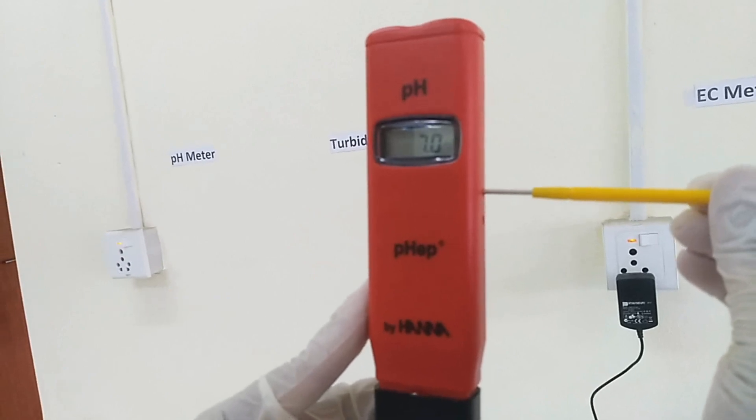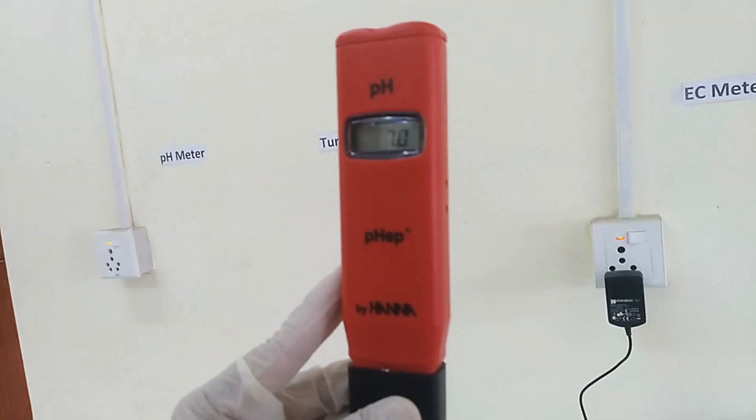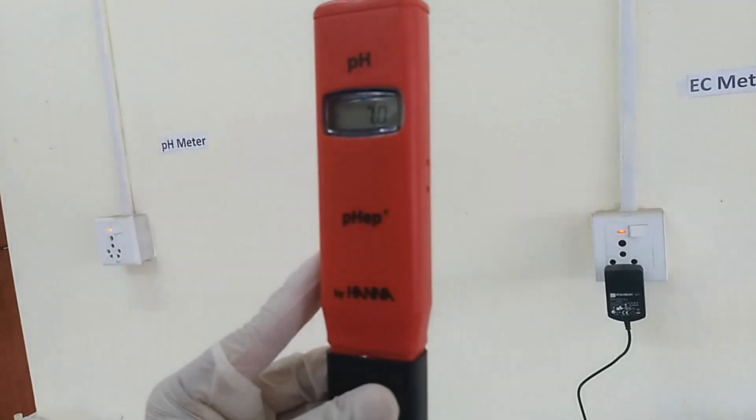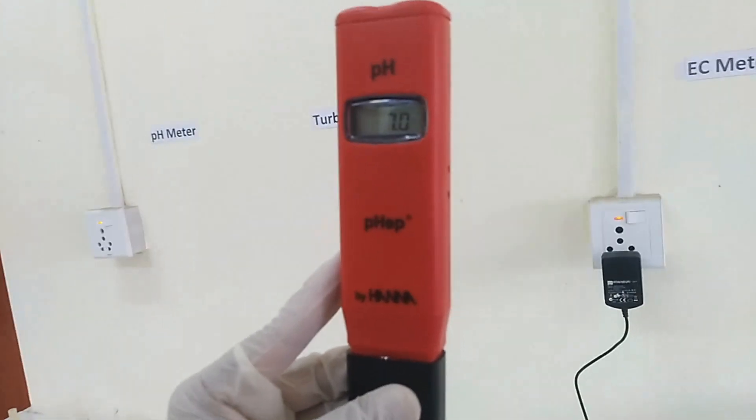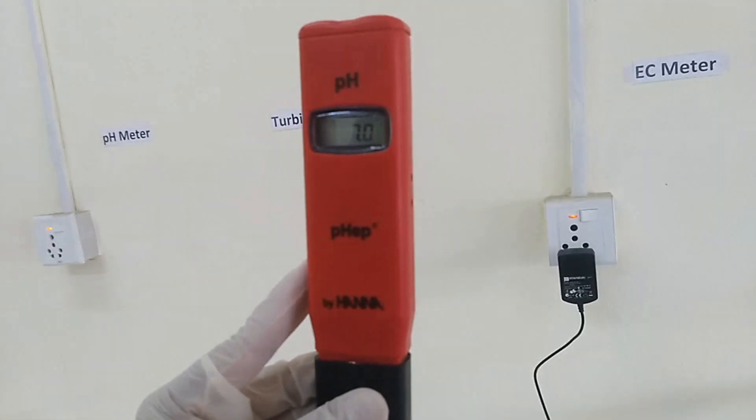So single-point calibration is completed. For more accurate result, do double-point calibration with buffer solution of pH 4.01.